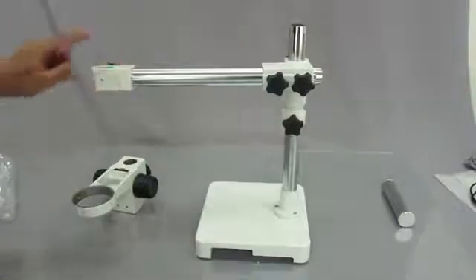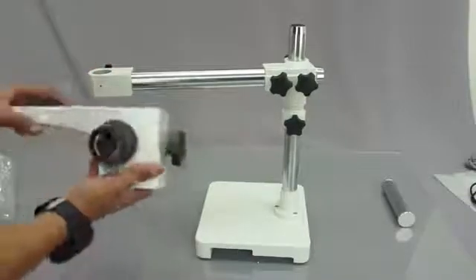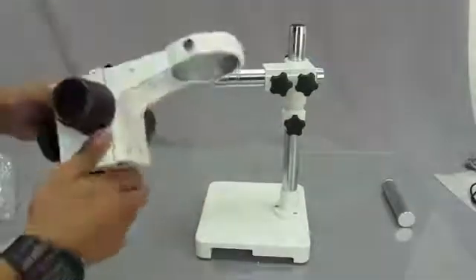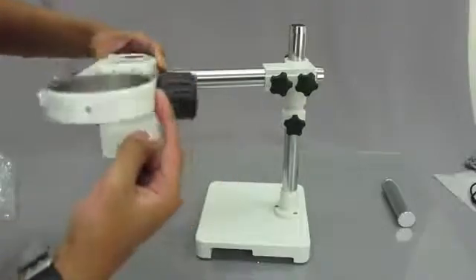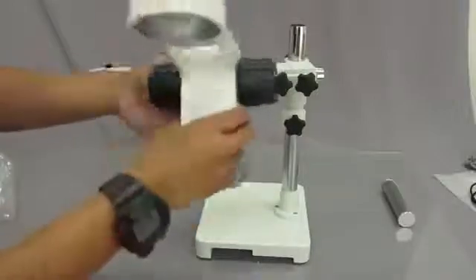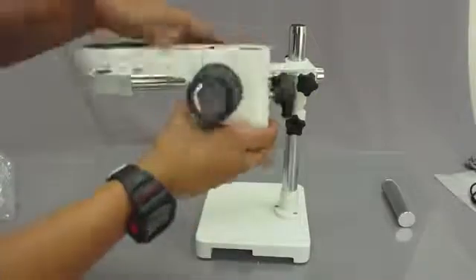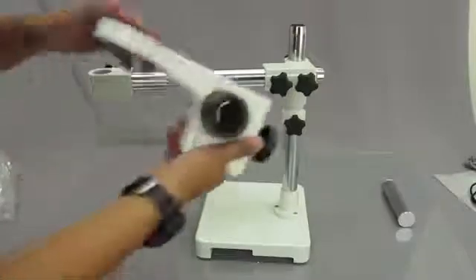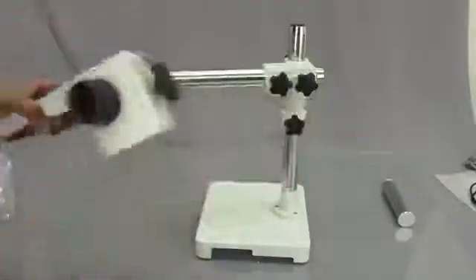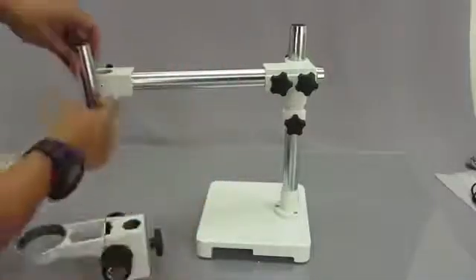After you attach that, the next thing you want to attach is the focusing rack. The focusing rack is the part that focuses the head of the microscope, and this is where you would place the microscope head. Notice how there's only one thumb screw here, but there are three sections on it. None of the microscope focusing racks that we have come with 3 knobs at all. It's always one. A lot of people usually call in and say they're missing the other 2 knurled screws, but they're actually not. In order to put this on, you need one of the other parts here. This is the part that holds it up right here in this direction.